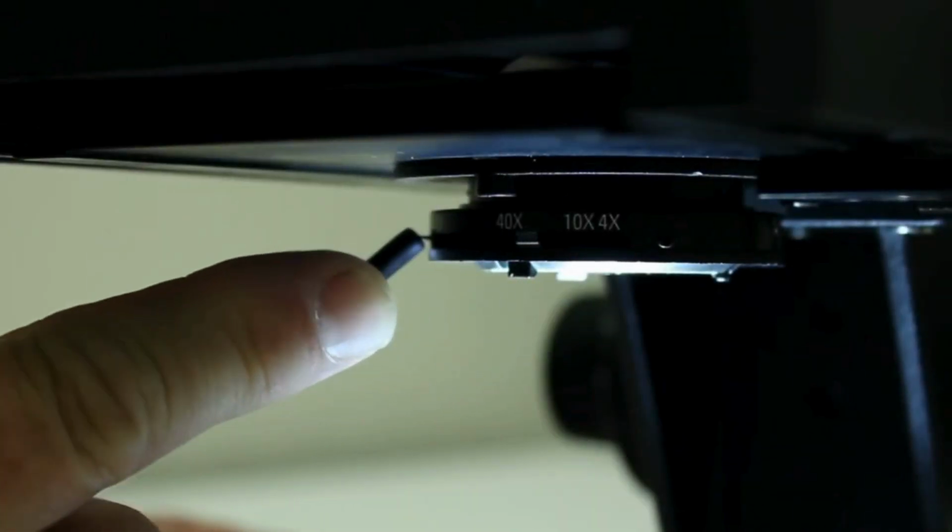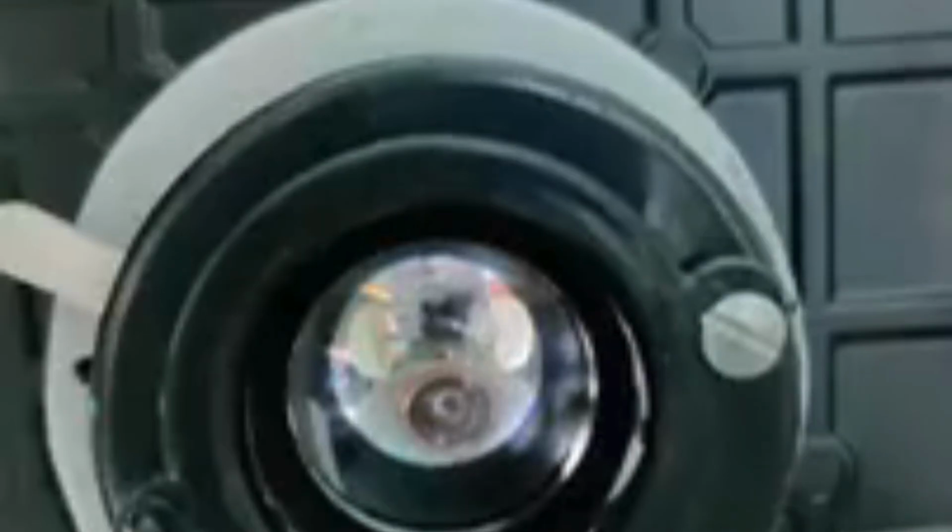4. Operating screws, condenser, iris diaphragm, mirror and stage clips should always be handled carefully.